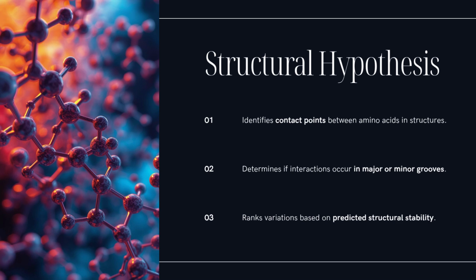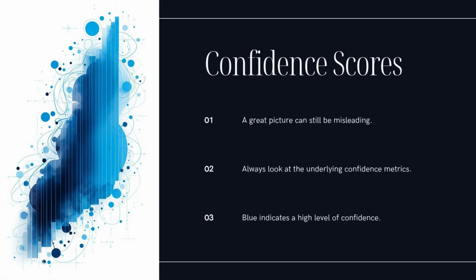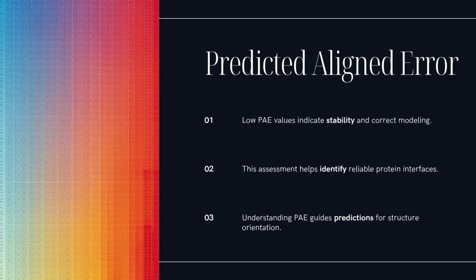And for the protein ligand example, how does that help, say, a drug discovery team? It's a fantastic rapid screening tool. Imagine you have 10 slight variations of a potential drug molecule. You can run OpenFold3 for your target protein with each of those 10 SMILES strings. Okay. Then you look at the predicted structures. How does the pocket shape change? Does the ligand seem to fit reasonably? You use the visuals and, importantly, the confidence metrics we'll discuss to quickly rank those 10 variations. You're filtering down the possibilities. Exactly. Maybe only 2 or 3 of them produce a prediction where the ligand looks well placed and the confidence scores are good. Those are the ones you prioritize for the more expensive, time-consuming follow-up experiments or simulations, pruning the search space early.